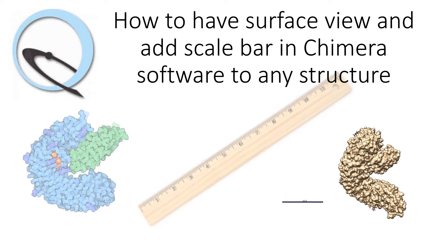Hi friends, today I'm going to talk on how to use the Chimera software developed by the UCSF group to visualize 3D structures of proteins, how to look at the surface view of any complex protein structure, add a scale bar to estimate the distance from one end to the other, and produce a publication quality image ready to put into any scientific journal.